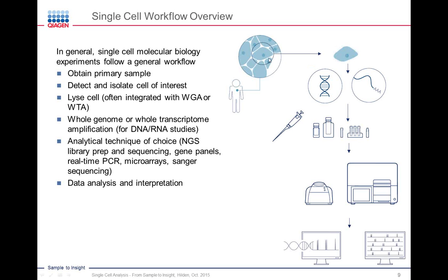In this case, we're taking a tissue sample, a solid tissue sample out of a patient. And from there, you will go straight into molecular biology of some sort. Usually, this is a DNA or RNA extraction kit, followed by some purification kits, followed by maybe library preparation and sequencing, maybe run it over a qPCR panel, and then you'll analyze the data with some sort of software. Even if it's just Excel, it's still a type of software.